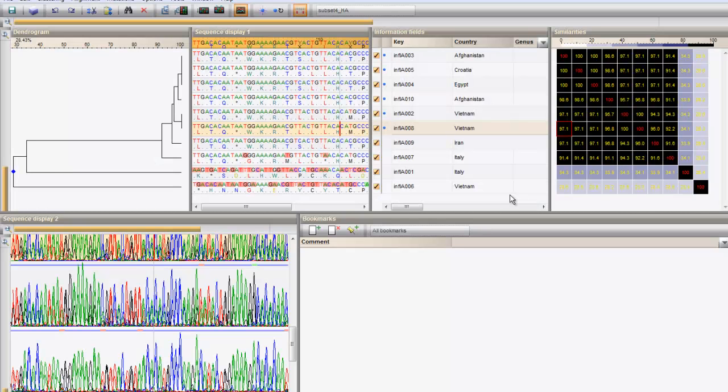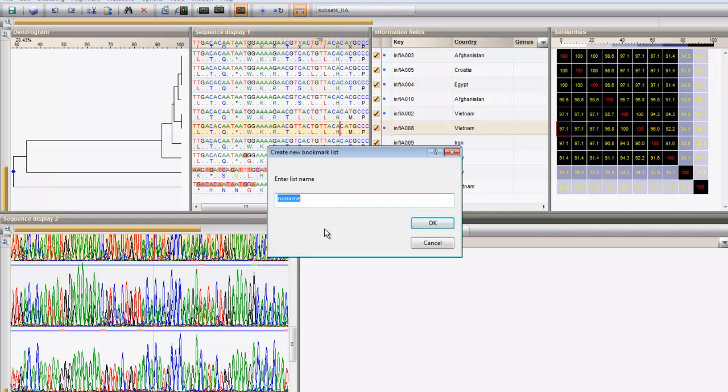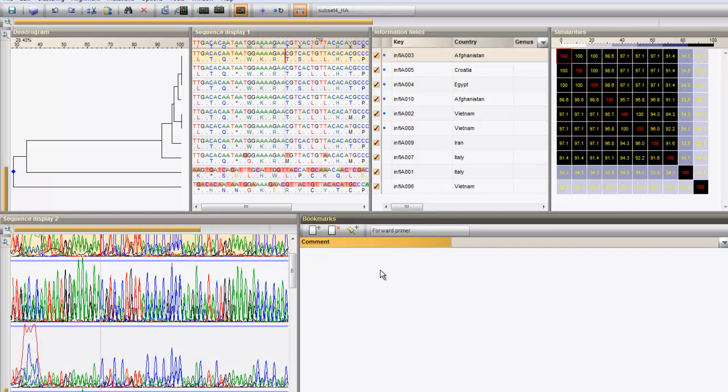A sequence position or block, corresponding for example to a primer or probe, can be bookmarked in order to retrieve it easily. You can add a bookmark list with this button and give it a name. Place the cursor on a specific position. Add a bookmark with this button.